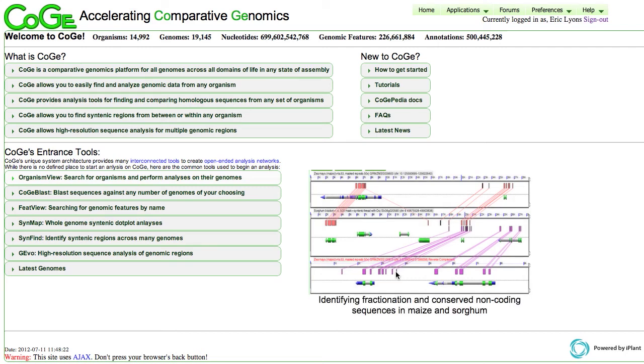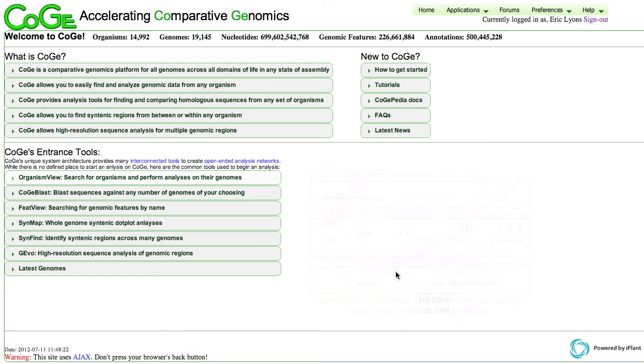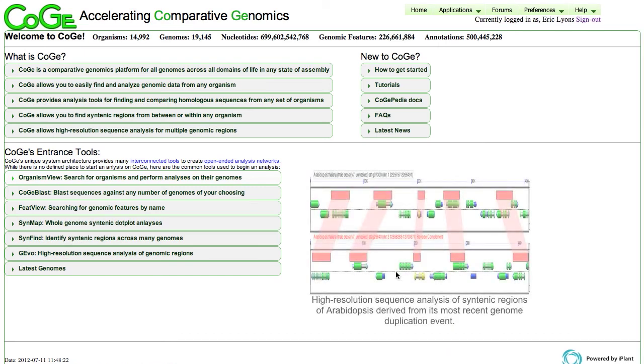Hi, this is Eric Lyons, and this is a tutorial on how to use CoGe to compare the genomes of a couple of organisms whose name I'm probably going to mispronounce, but I think they're called phytophthoras.